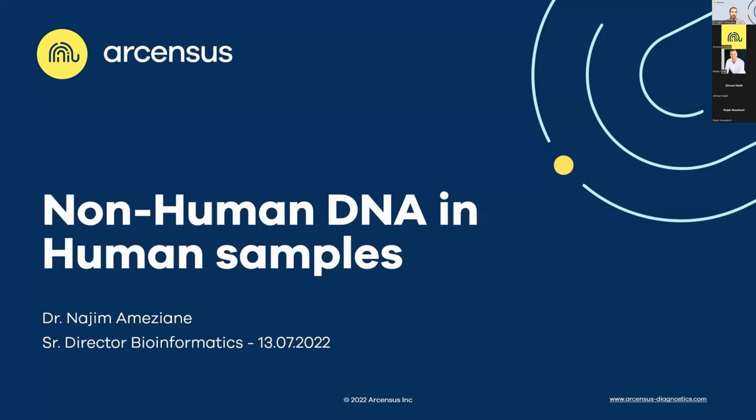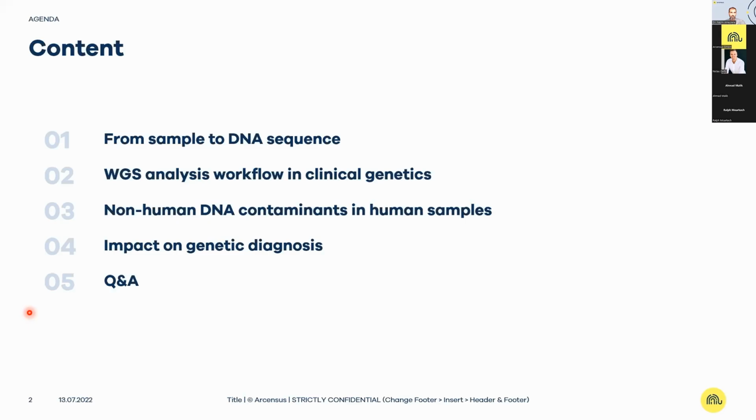Okay. So today, I would like to discuss with you some of the findings that we did at our company. Since we are doing whole genome sequencing for samples in a diagnostic setting, when we started doing this analysis, we stumbled upon the presence of non-human DNA, and this is what I would like to discuss with you and explain to you what we identified.